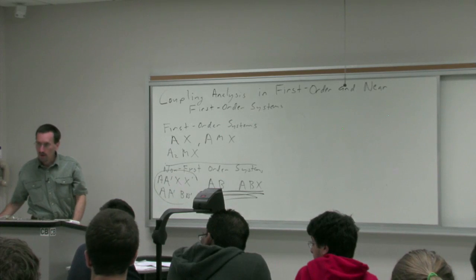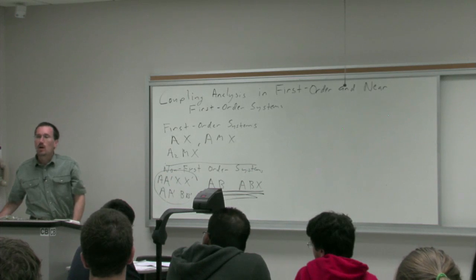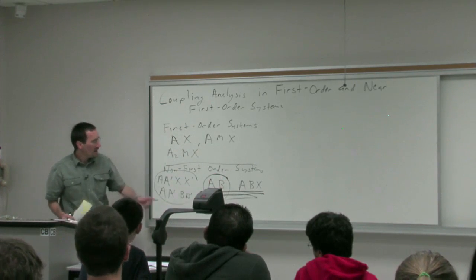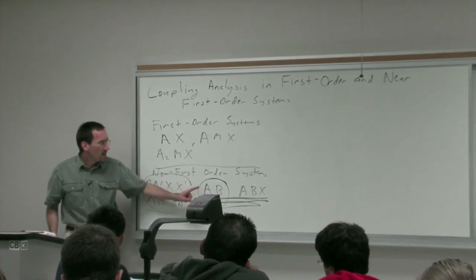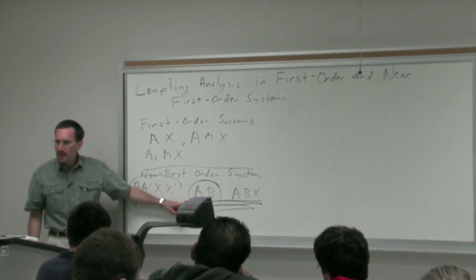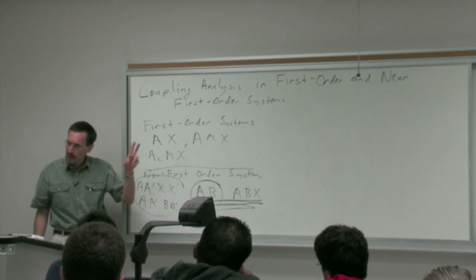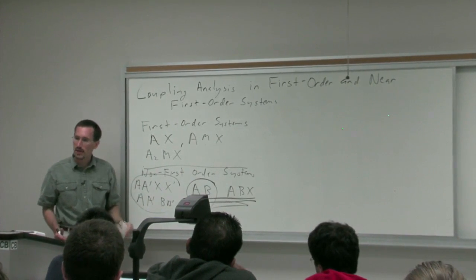So whether you use X or B is based on the separation of chemical shift, not the actual distance between them. Let me show you exactly, and let's take the AB system, because I think this is a great starting point. The AB system is going to be an archetype for many sorts of systems that, although they're not first order, we can apply first order analysis to, and we can start to see the distortions that occur.